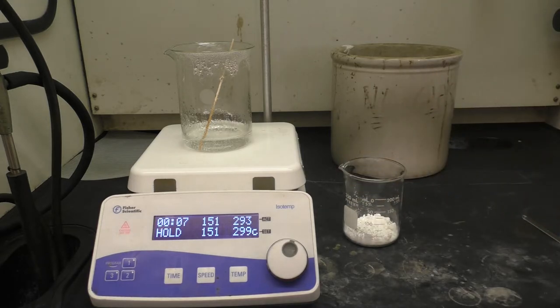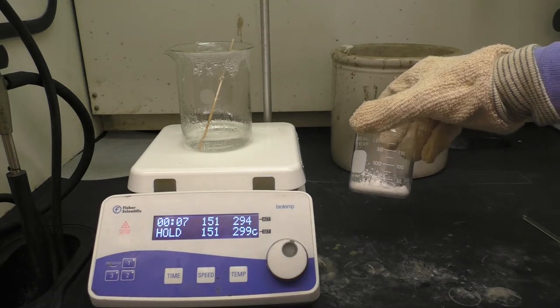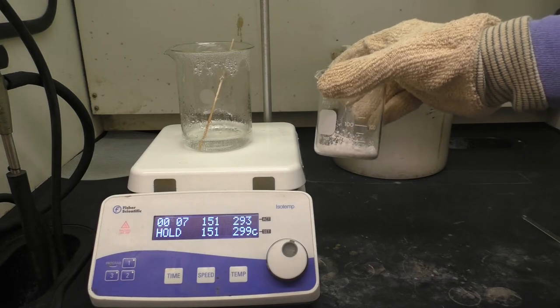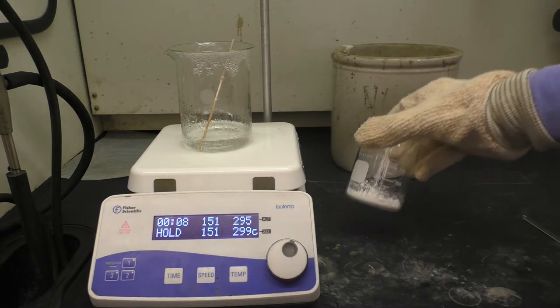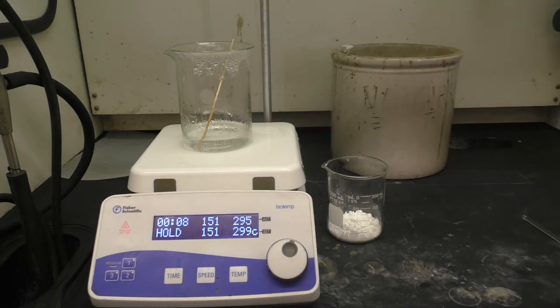Now, once I've added enough water to cover the bottom of the beaker here, I'm going to want to place this on the hot plate as well to keep the solution hot, because ideally I want to dissolve all of the solid material in hot water and then let it cool down, and using the change in solubility between hot and cold solution, hope to recrystallize our material. Now, I don't want to place it directly on the hot plate before I've added water, because I don't want to singe or burn the solid material. I want to have that water to help mitigate the heat transfer.